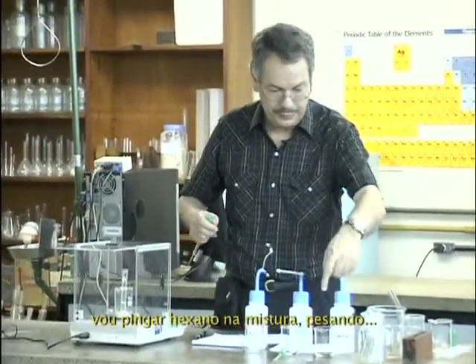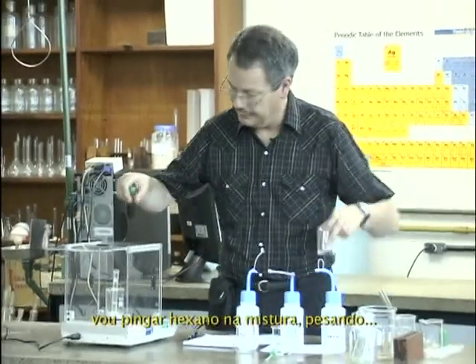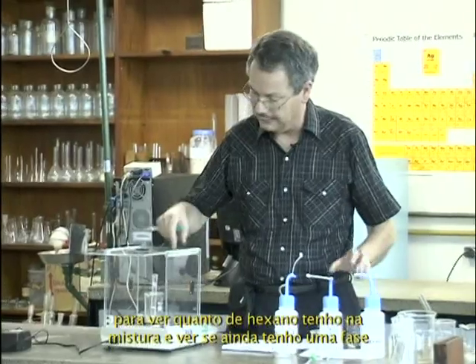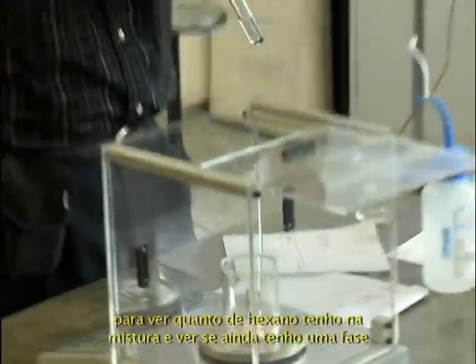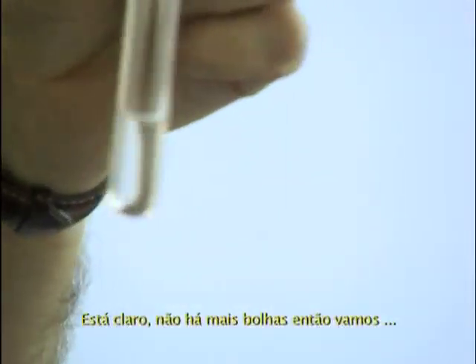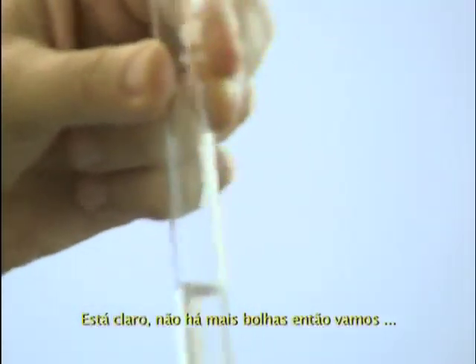I will drop hexane in the mixture, weighing it. So I'll weigh how much hexane I have in my mixture to know when it's one phase. So I guess now it's clear, no more bubble.